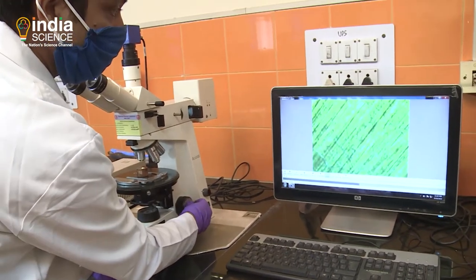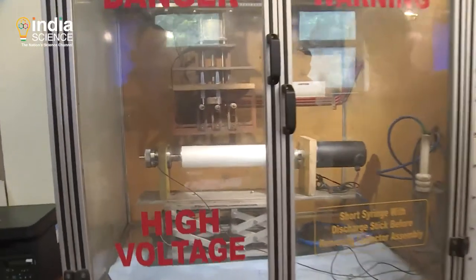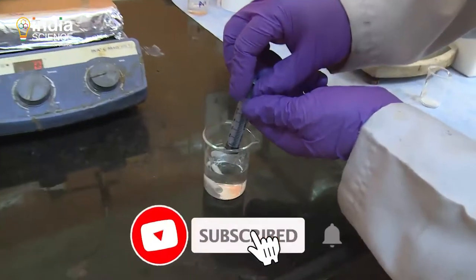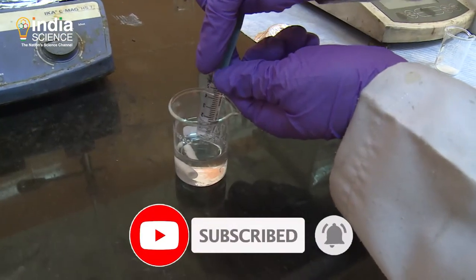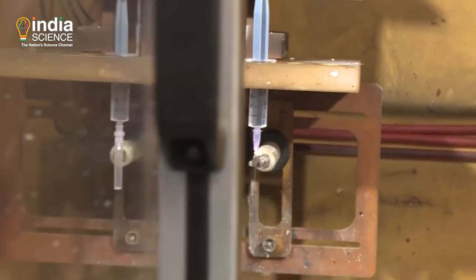Nano fibers are spun from polymers using an electrospinning machine. First, the polymer is weighed and a solution is prepared with a solvent, which could be water. The solution is then fed into a disposable syringe and fed into an electrospinning instrument.